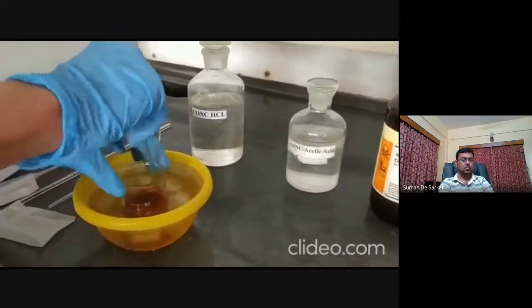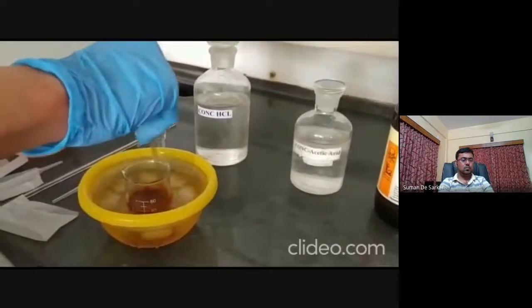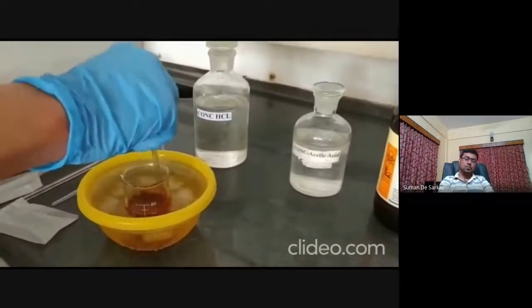And now the color changes from red to orange.